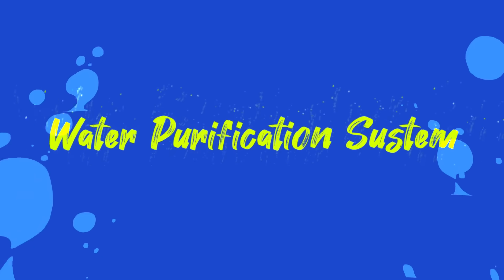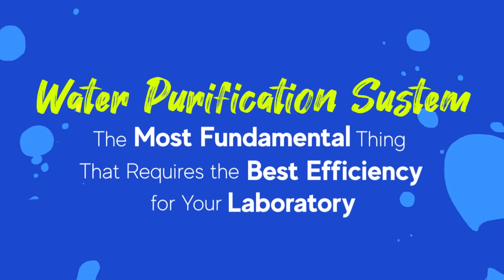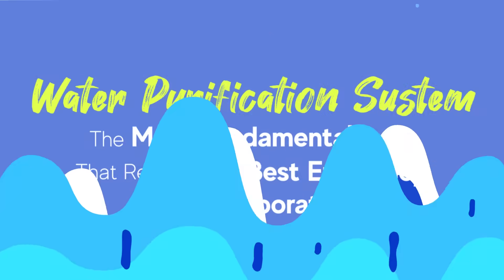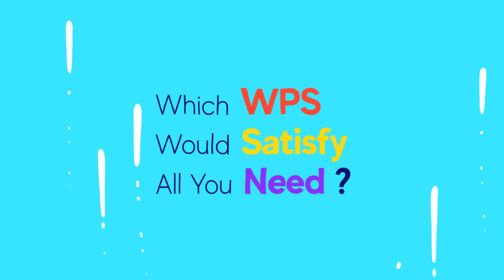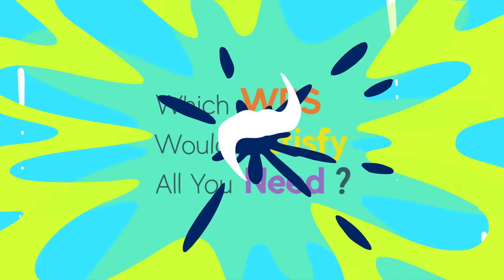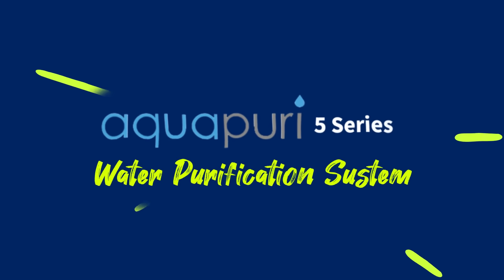Water Purification System, which is also called WPS, is the most fundamental instrument that requires the best efficiency for your laboratory. Which WPS would satisfy all you need? Let's look into Aqua Puri 5 Series and how it guarantees all efficiency.